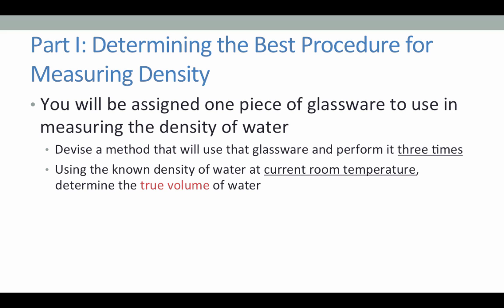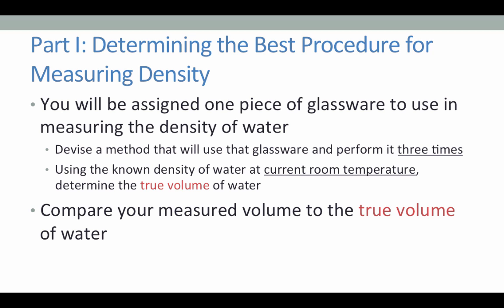Next, you will use the mass of the water and the known density to calculate the true volume of that water at the current room temperature. By comparing your measured volume to this true volume, you will have an idea of the accuracy and precision of the glassware you chose.